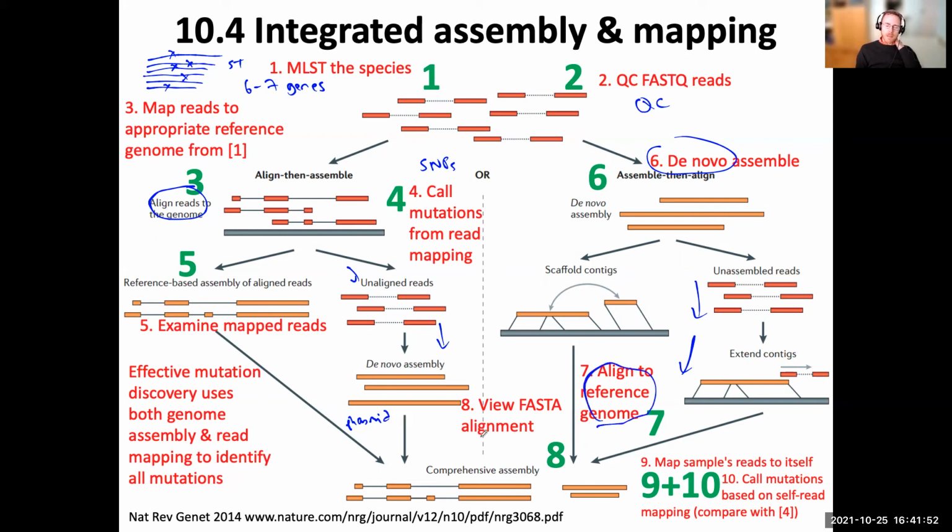And therefore, we can link these two results together, bearing in mind that de novo assembly is better for looking at structural variants, whereas read mapping is better for identifying SNPs. Consequently, our approach is really using the integration of both techniques, one focused on mapping, one focused on assembly.